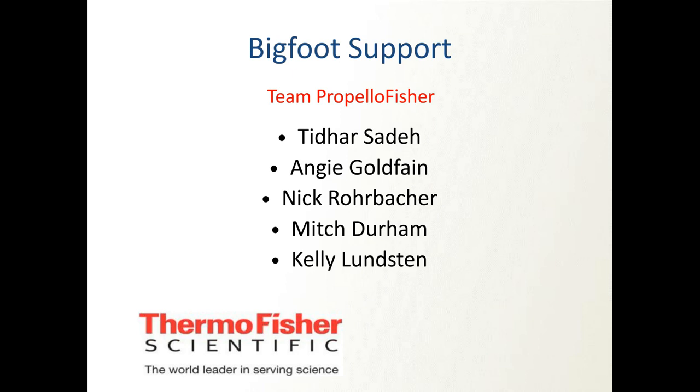And I do believe spectral is totally the way to go, future forward, in high dimensional flow. I think the Bigfoot's an amazing platform. And I love the competition in this space between Cytek, Thermo, and Sony to all have these high dimensional spectral systems. I'm impressed by what I've seen so far. And I think in the next couple of years, we're seeing the same growth we saw when we switched from analog to digital. Now we're switching from classical to spectral, and that's where the future is.